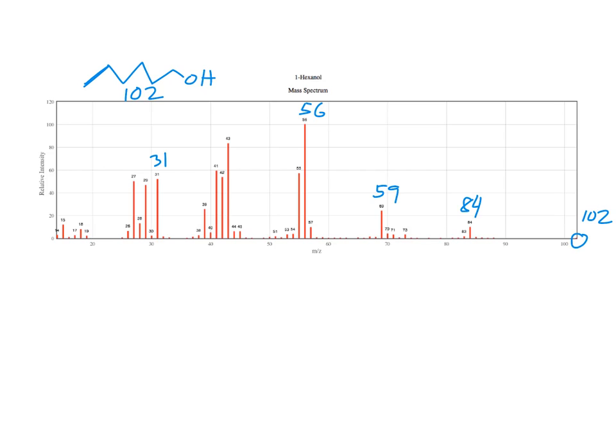All right, so we're seeing a couple of odd electron ions. So what about 102 to 84? That's the loss of water. So it's a loss of 18, so we're actually losing a water molecule.